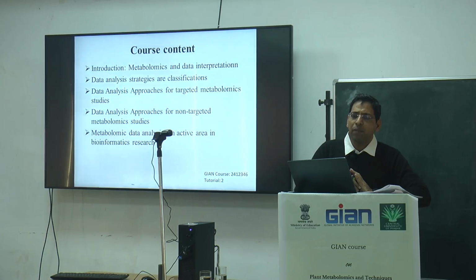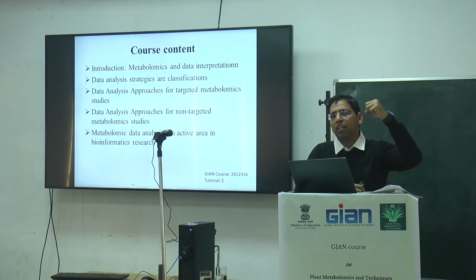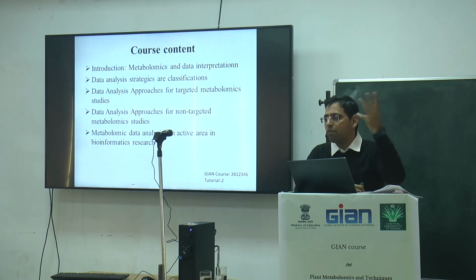As someone asked me which solvent you have to use, every chemical is imparting a heterogeneity to a cell actually. So if you remove a chemical, it does not mean that everything will be okay in the cell. When you add a new chemical, you can't think nothing will be disturbed. Maybe the overall picture inside the cell is changed.